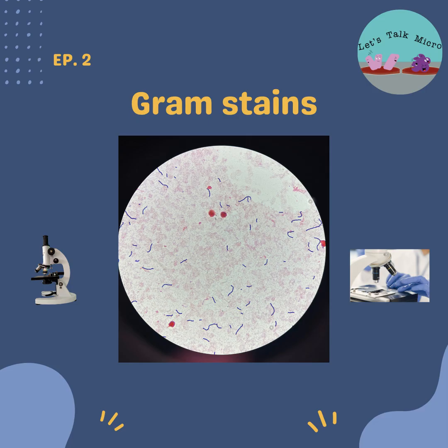So with the gram stains, bacteria just stain either positive or negative based on the differences in their cell wall composition. By positive and negative, we'll talk about the components, but positive is purple, negative is pink. Gram-positive bacteria have a thick peptidoglycan cell wall. How does this affect the staining? Well, your initial stain, which is the crystal violet, is purple. So it will retain that initial dye, and then it will not get affected by the decolorization process.